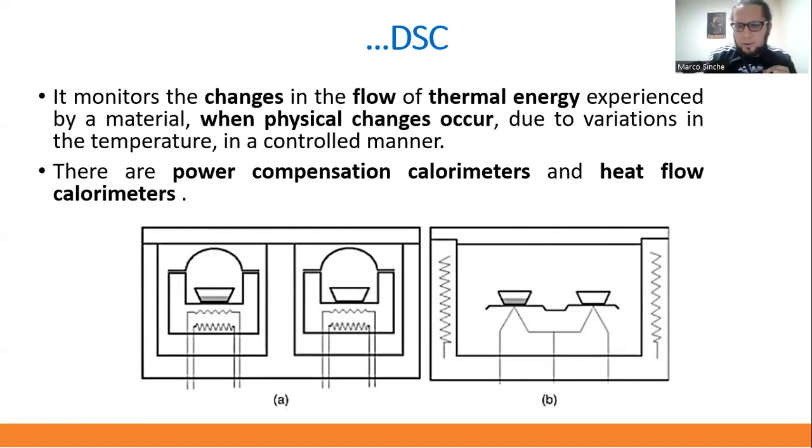If one wants to keep a constant temperature, one will study the changes in the physical structure. But in the other case, one could try to keep the same type of thermal flow, despite changes in the temperature.